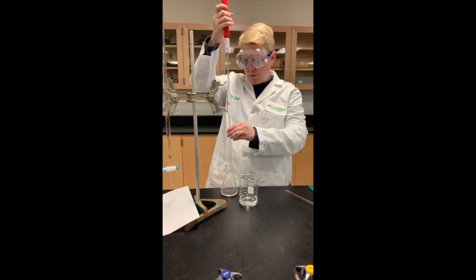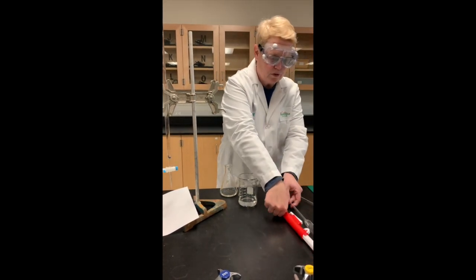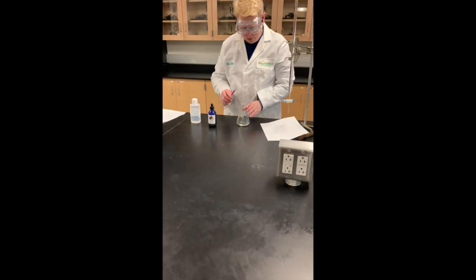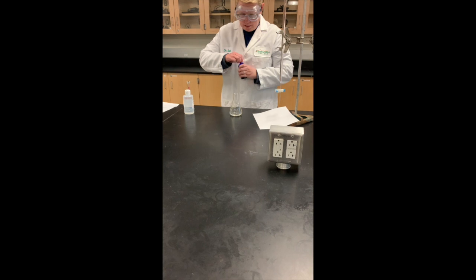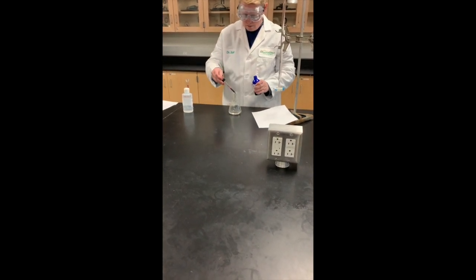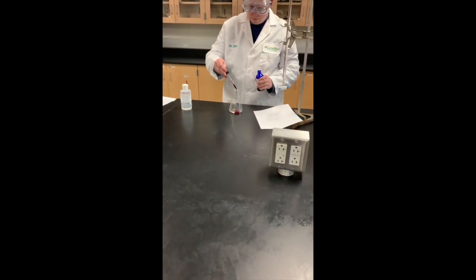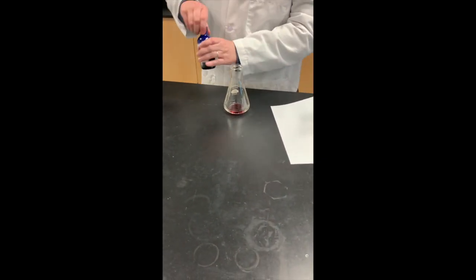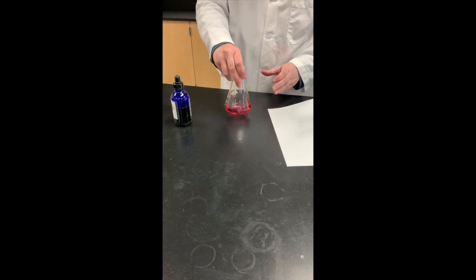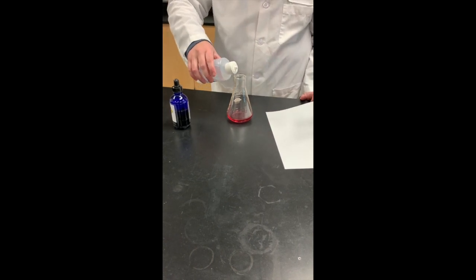Now with these volumetric pipettes, they will leave a drop in the tip. It's designed that way, so don't blow it out. Okay, we'll put that over there so it doesn't roll away. Now we have our sample, and we're going to treat it just like we did our blank. We're going to add our 5 milliliters of our pH 10 buffer. We add our 8 drops of Calmagite indicator. Okay. And then we're going to add our 15 drops of the magnesium chloride solution. And this, we might add a little bit more, but that's okay.